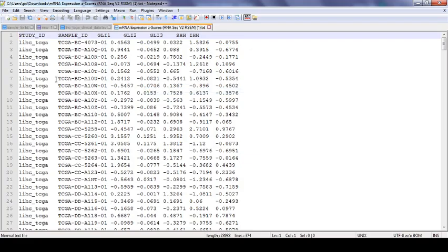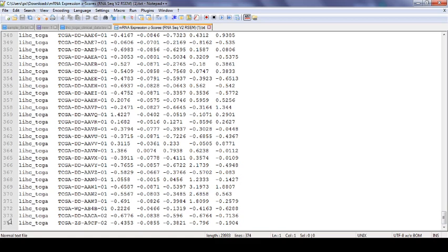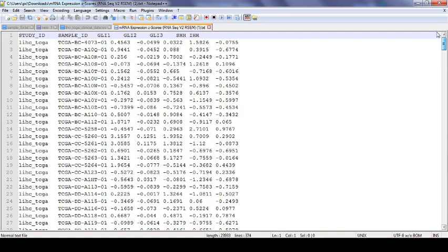And here you can see now that all the 373 patients, these are 374 lines because the first line contains the header. So for the 373 patients, the expression information of each gene, that this is expressed at this level, you can download all the information like this, right?